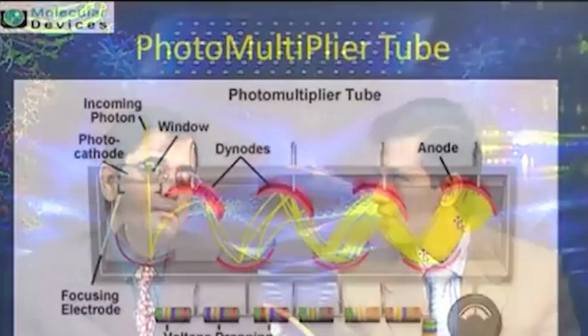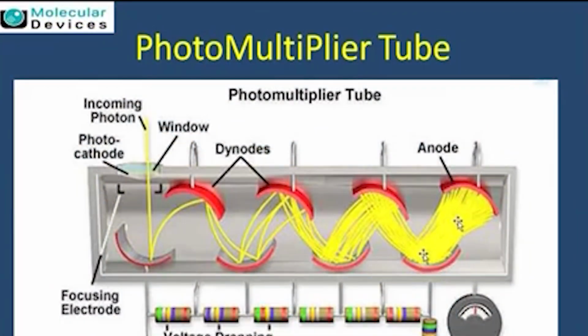Yes, essentially because they are all not present equally, the data could be right from zero intensity, which will be equivalent to the background, to the very highest intensity. So the best way to control the variations is looking at the photomultiplier tube. Actually, that is nothing but once you do a fluorescence, the intensity is coming out of that. So the very low expressing genes or proteins will give you very low fluorescence intensity, whereas the high ones will give very high intensity.